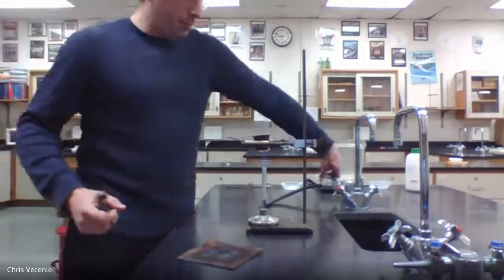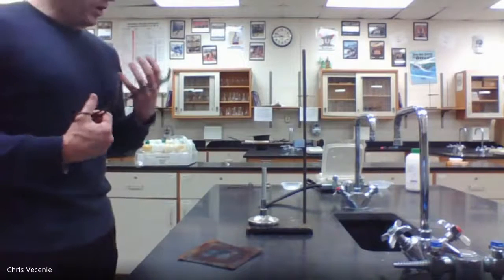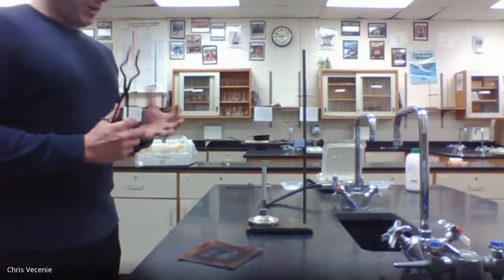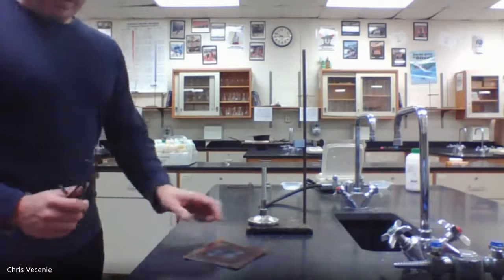All right, now, from this point on, my Bunsen burner, all right, has heated this to the point it's far too hot to touch with my hands. And furthermore, I don't want to touch it much because any of my skin that gets on there is going to affect the mass. Right, but we need to go get the mass of this guy.